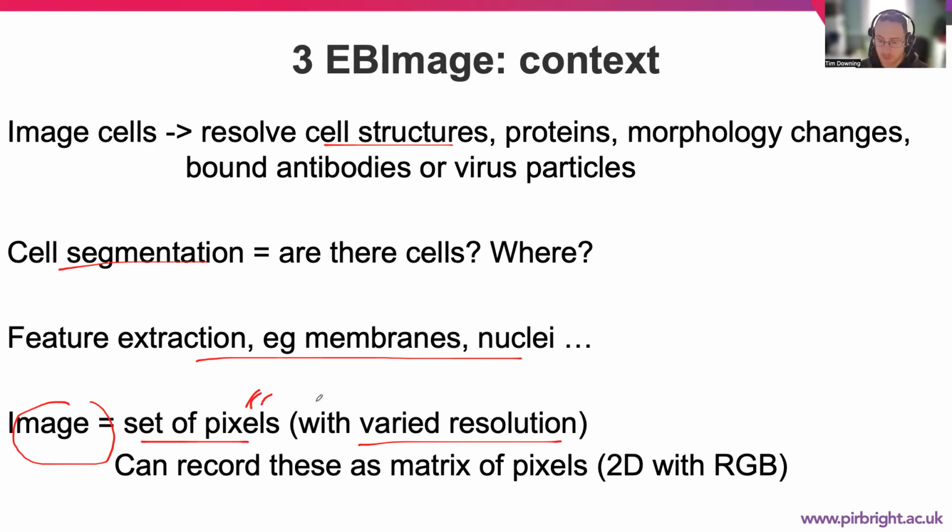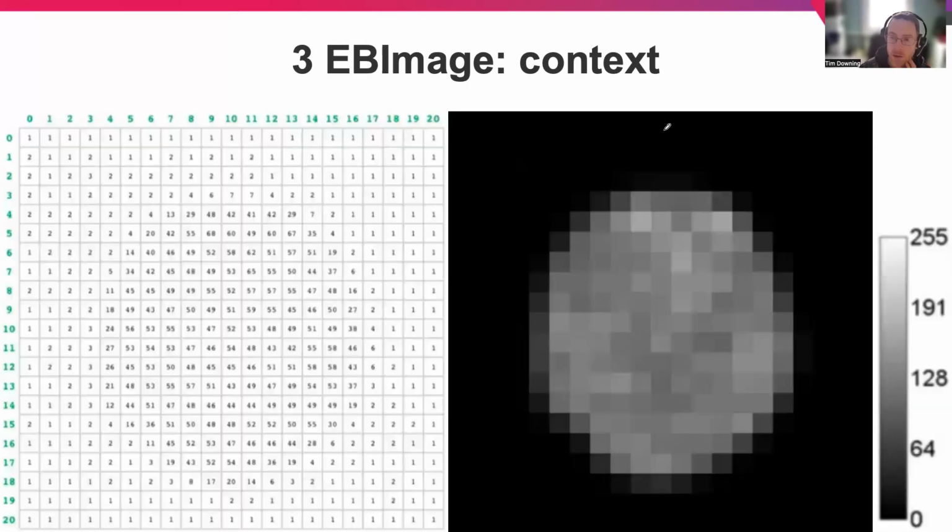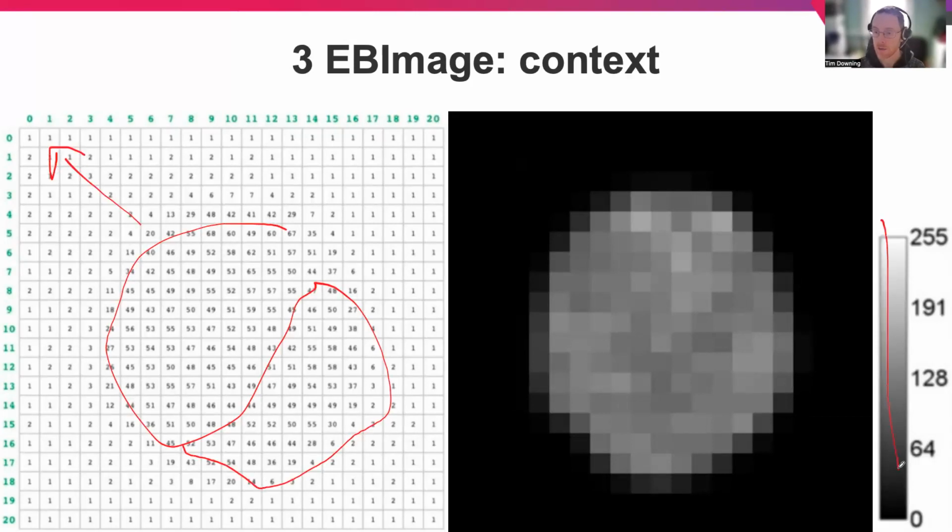And therefore, we're really thinking about how we take in our PNG and take our image X and how we can transform it. So we have different pieces of information inside that image, and we can adjust them by modifying intensities and so on, and rescaling them, background and things like that. So we can think where we have brightness and things, B is maybe the contrast. So if we look at an image like this on the right, what essentially is recording is levels of brightness here going from the middle where we have our object to the outside where it's much darker. And we can scale that, we can modify that scale.